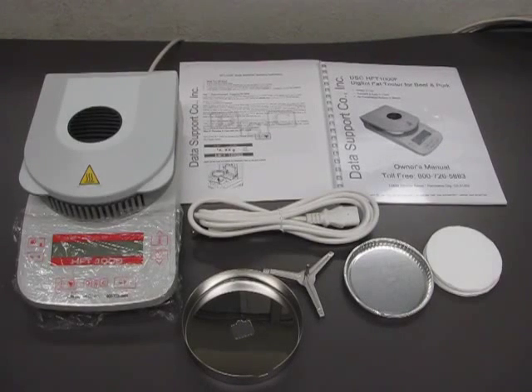Hi, I'm from Data Support Company, and this video will show you how to set up your fat tester.